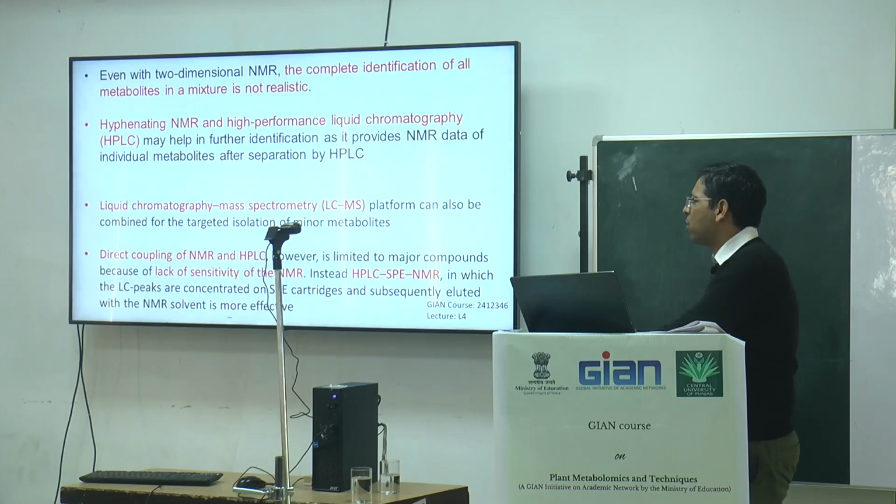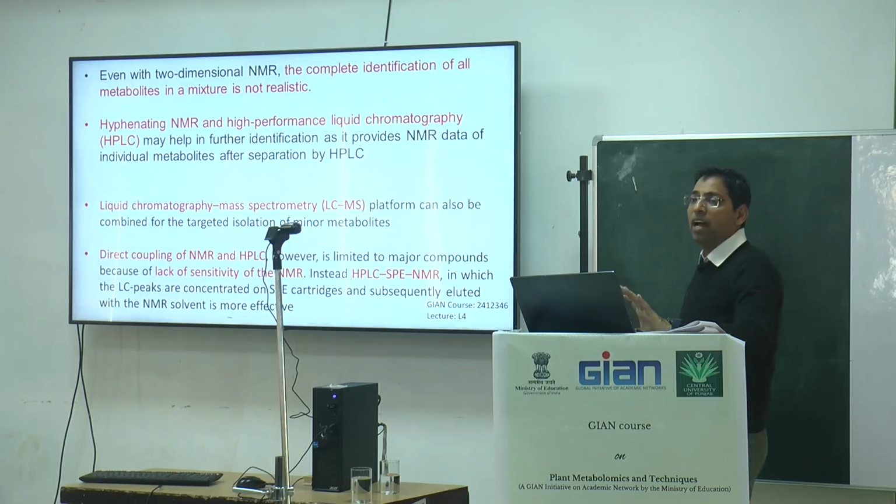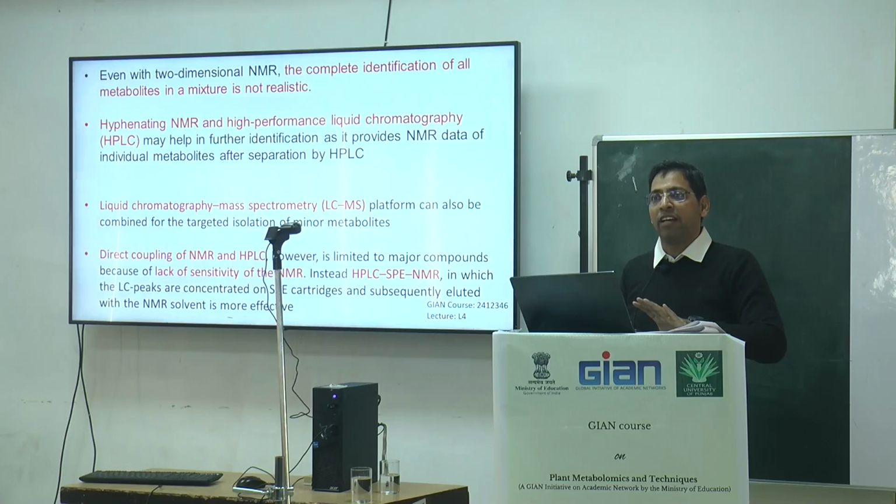Another important point is that you can go ahead with HPLC-SPE-NMR, in which you are using SPE, and that is a good thing. That can be recommended for further use if you want to integrate the chromatography and the spectroscopy along with the data analysis. So sometimes NMR is not the only single approach we can use; sometimes we recommend the integrated approach in which both the chromatography and the NMR are used for metabolomics purposes.